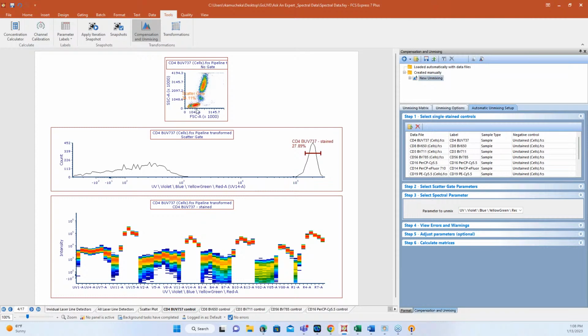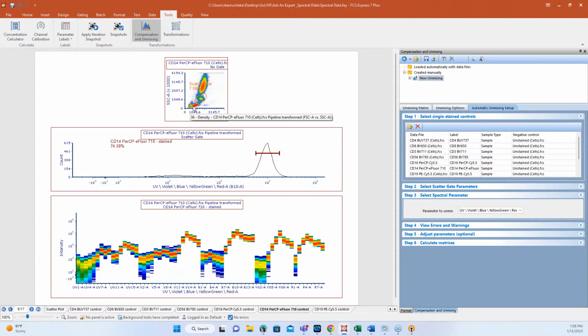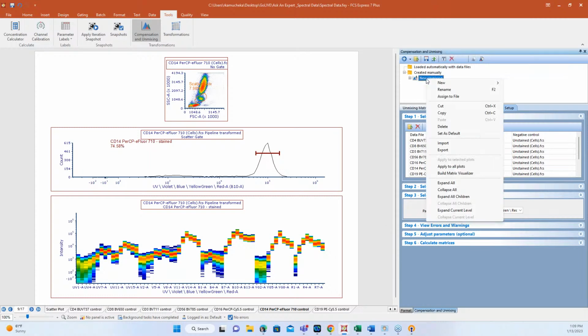I can check my scatter gate because I want to make sure, especially in this experiment, that I'm getting the right population, right? Because I'm not going to get a good signal for certain populations if I have the wrong thing selected. So if I have the lymph population selected, I'm not going to get a good monocyte population showing. So I had to increase or move that scatter gate to make that data specific here so that I could then see my peak and help the software define and separate this a little bit better.